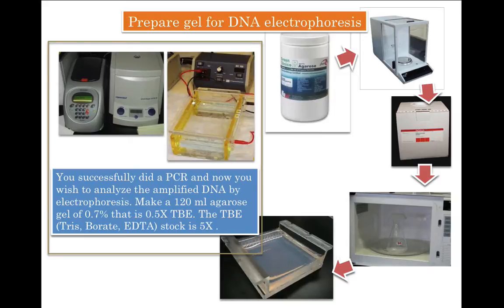Let's make 120 ml of 0.7% agarose gel in 0.5x TBE buffer. TBE buffer consists of Tris, borate, and EDTA, and the stock TBE concentration in your lab is 5x.